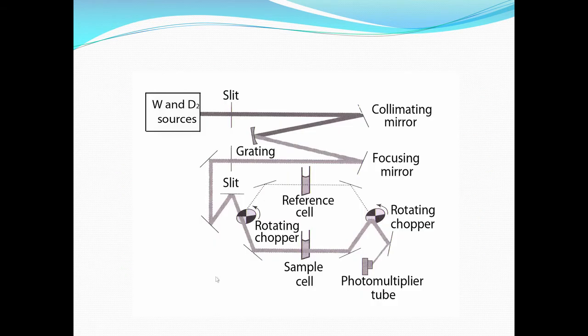So, this is the kind of arrangement we normally see in a spectrophotometer, that is tungsten and deuterium source, and this gets alternated up to 350 deuterium source, then this whole thing rotates and tungsten comes to the fore.